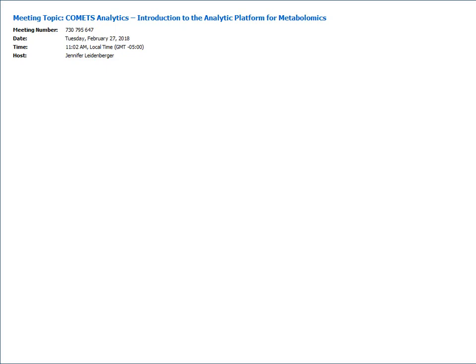He starts with HMDB ID. If you look at the UID01, which is the metabolite variable that identifies a given metabolite across COMETS, a lot of them start with HMDB something, and that's the first level that he uses, and it goes from there to chemical ID. I'm not sure if he's using retention time and mass charge yet, but we'll be documenting that very carefully, as we think that's also very important, and we can share that with you once we have finalized the documentation.